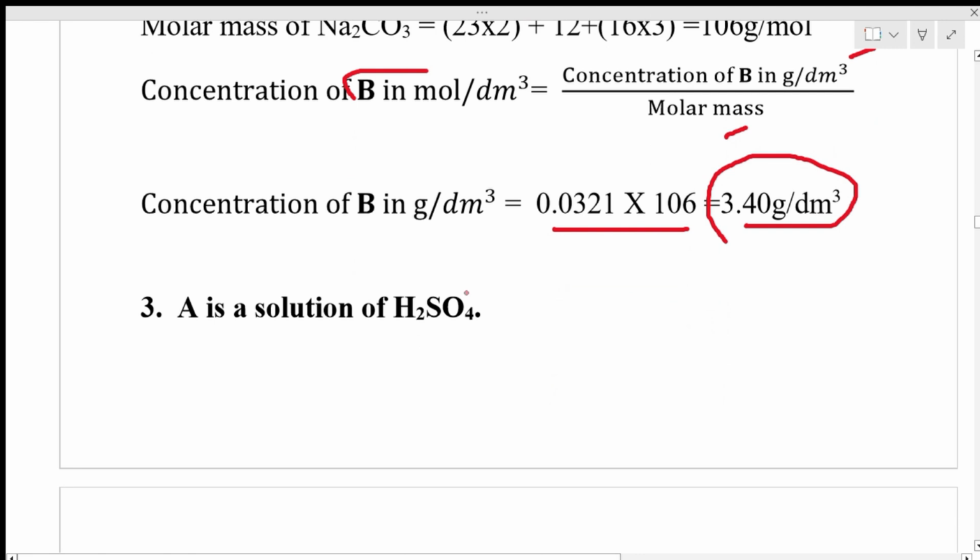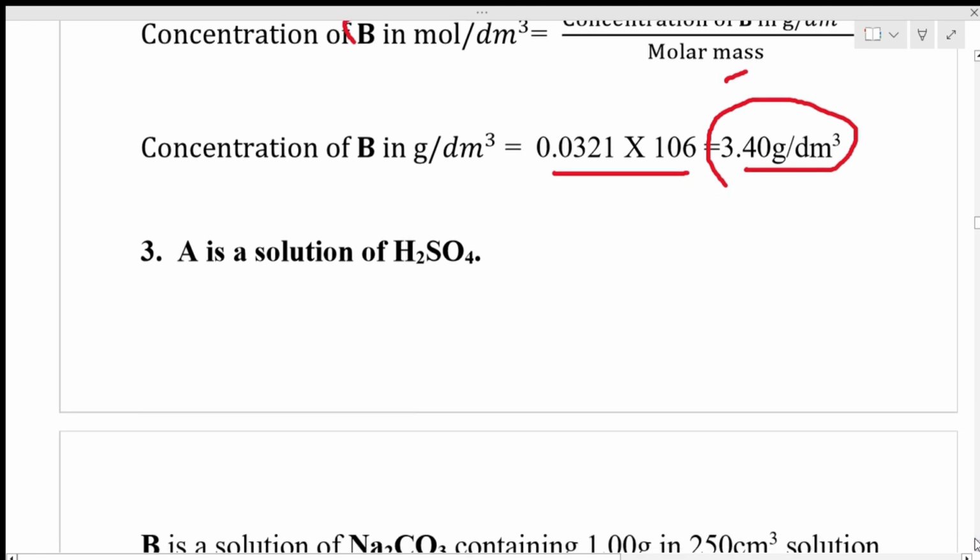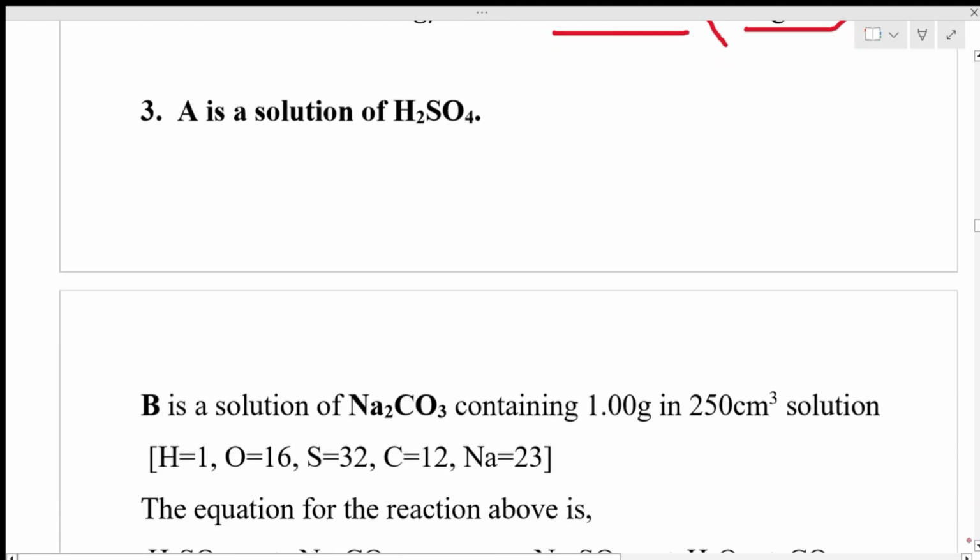Good. I think we are moving forward. Hope you are getting it. Just follow it closely, you will get it. Titration is very sweet. I love doing it. My practical is one of my strengths.